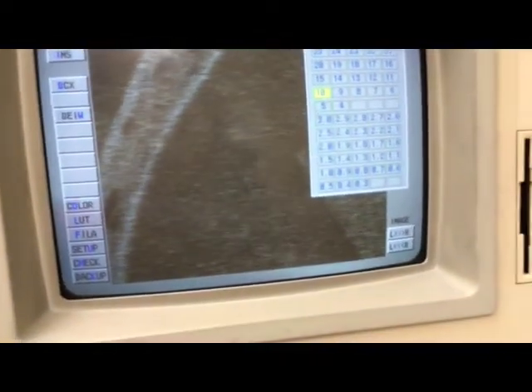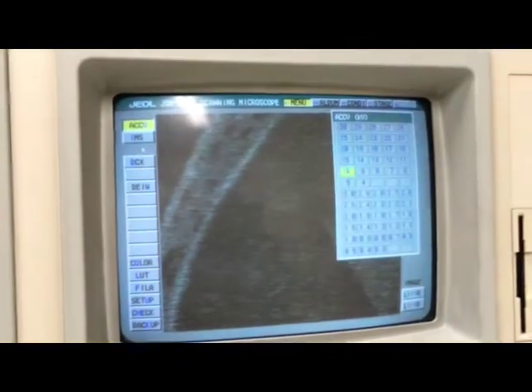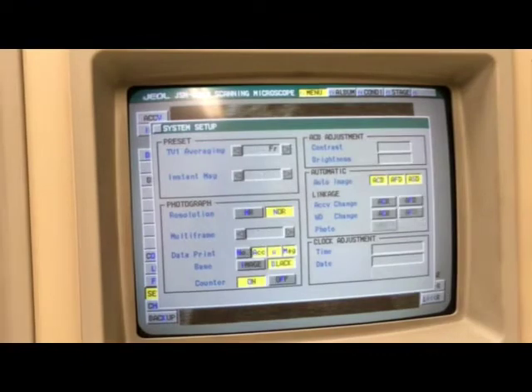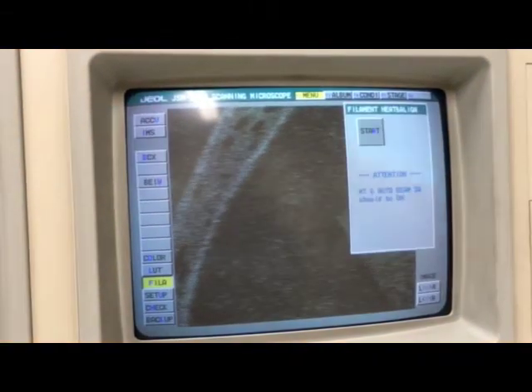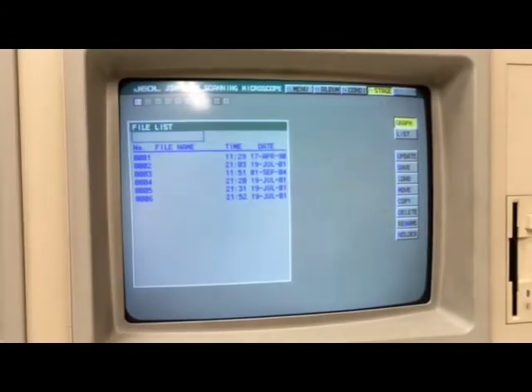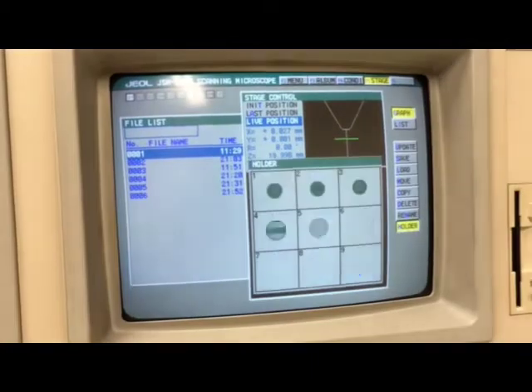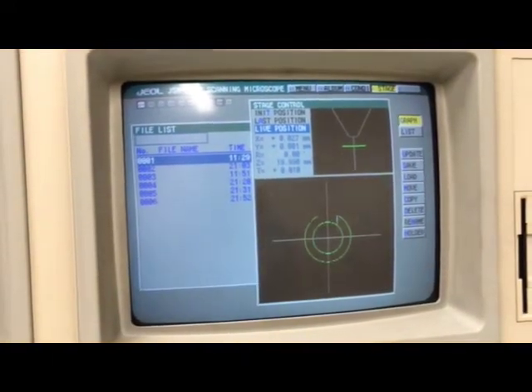First is SCCP — set it to what you want here. Go back to the menu and you can adjust here as well: filament, colors, etc. Now we move to the stage. My stage is already in the center. Please choose the holder — I already chose holder number two, so I don't need to choose again. That is the first preparation step.